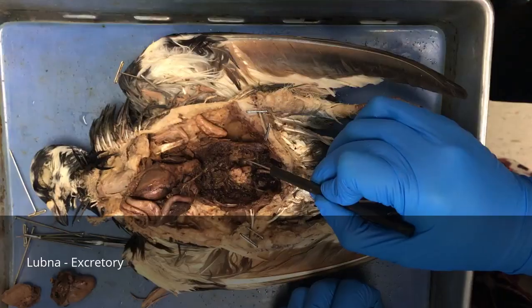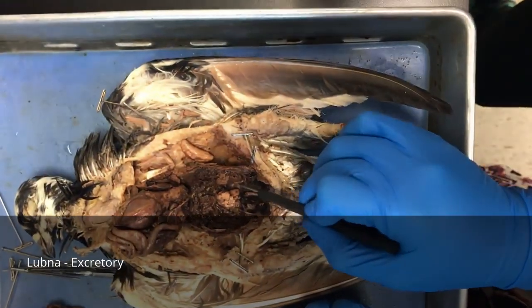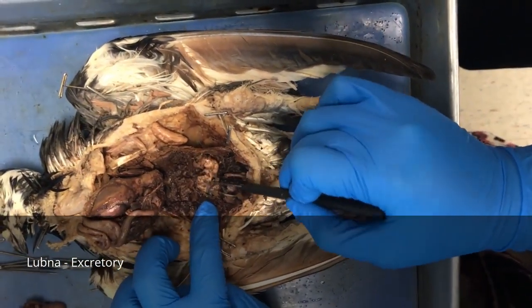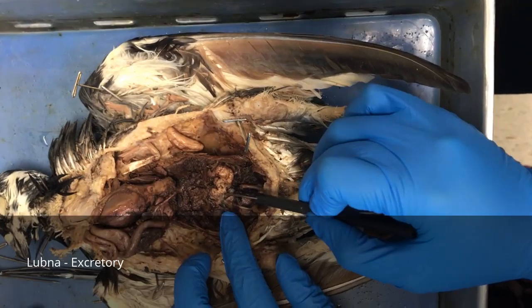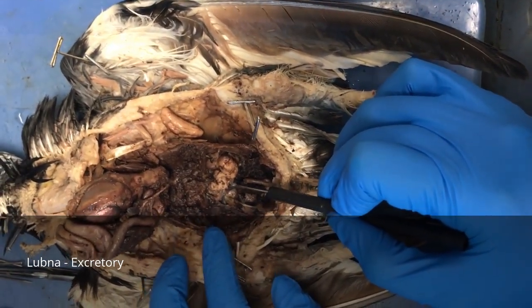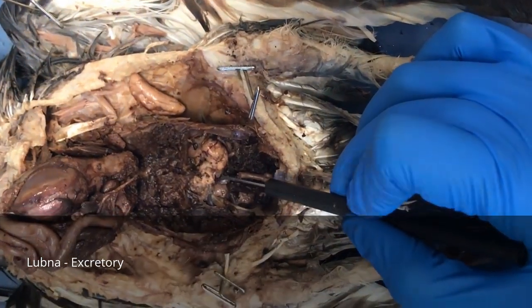Got it? Okay, so these right here are the kidneys, and there's a set right here on this side and also on this side right here. And here's where the urine is produced, and it regulates volume and composition of blood.